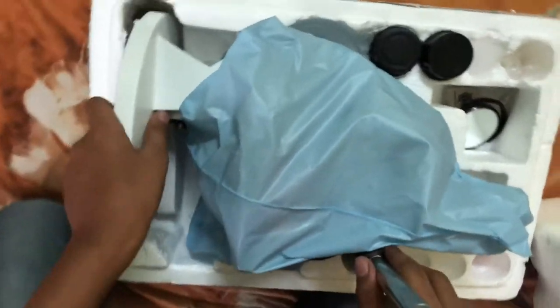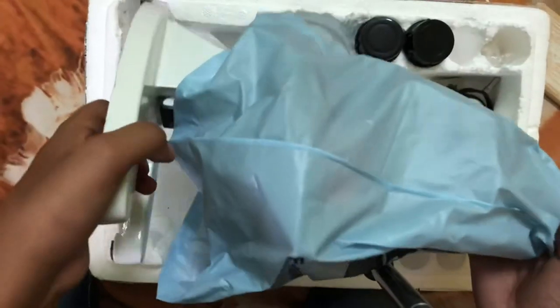I'm going to open it. I'm going to cover. Let's go around. I don't need it. Compound microscope. And this mirror. Just here. Slides. And here, I think, it's cover slips.